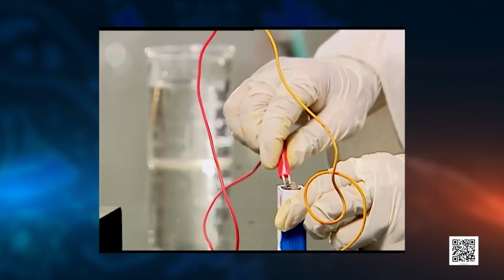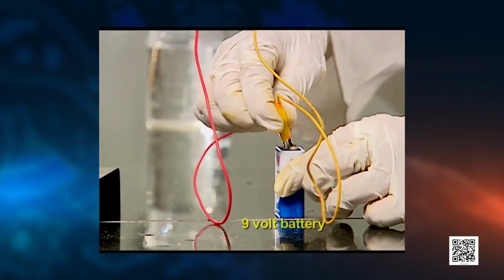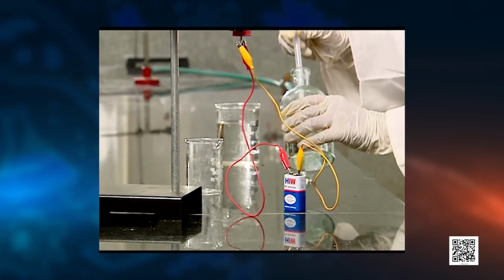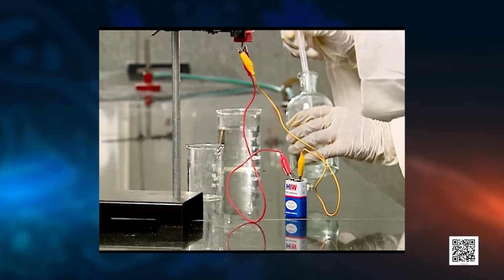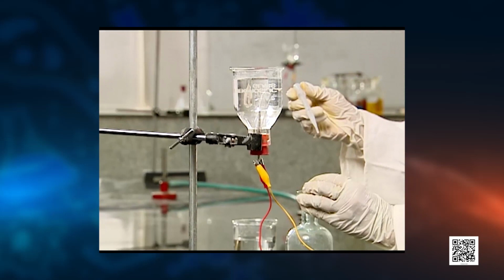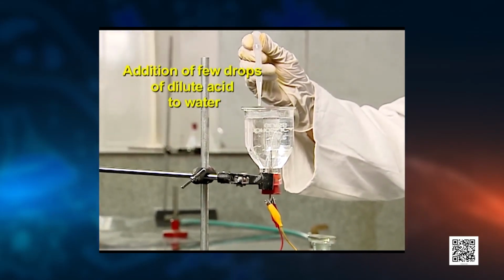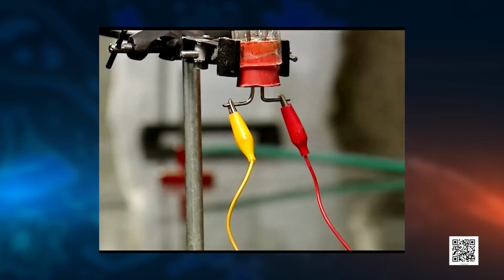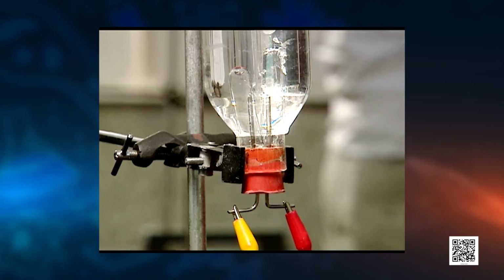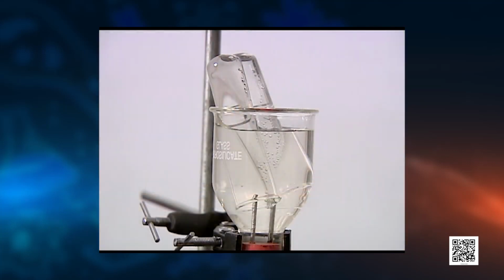Remember, this is decomposition using electricity. So water will decompose by passing electricity. A few drops of dilute sulfuric acid are being added to the water so that the reaction becomes fast. Now look at the video carefully. See, the reaction will become fast here. Slowly, the gases will collect in these. What do you see? Formation of bubbles taking place at both the electrodes.